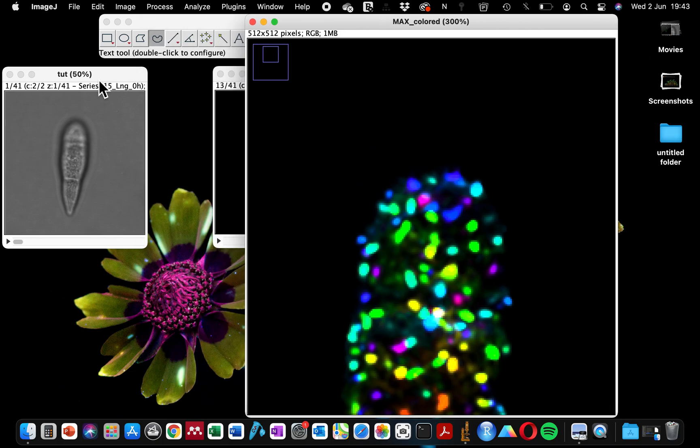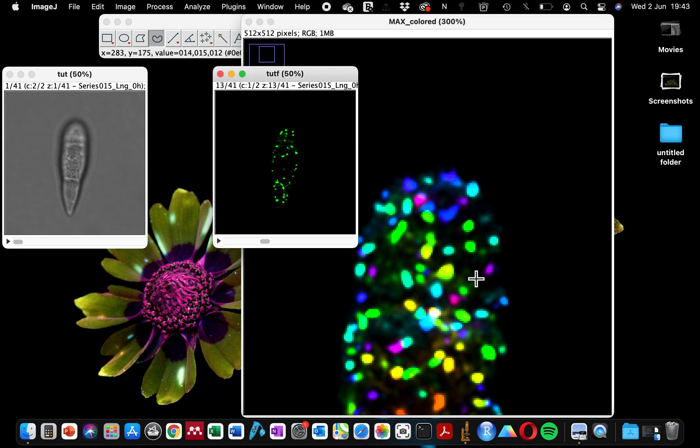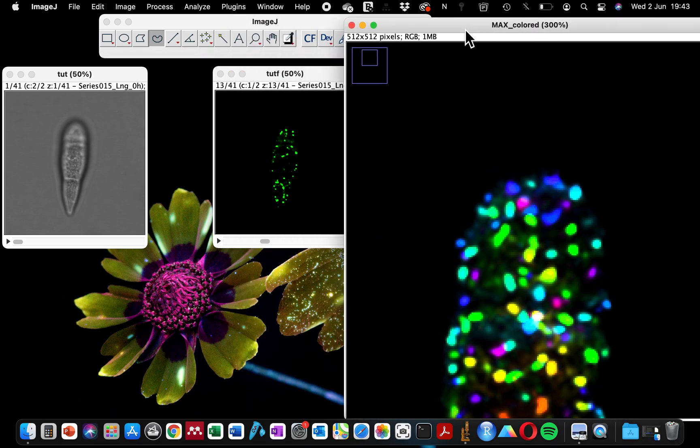This one here is my sample that I've color-coded. You can see how beautiful it is.